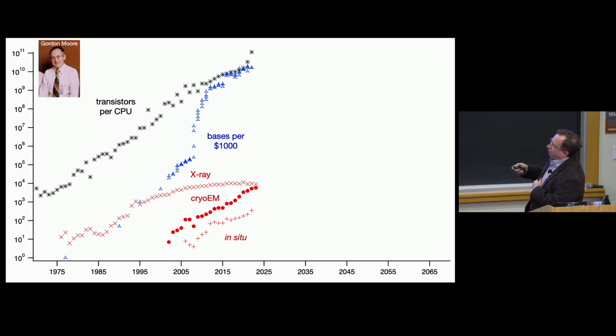If we now come closer to home in structural biology, if you look at the number of X-ray structures that have been solved, it was on an exponential trajectory for quite a long time, a couple of decades, but it did plateau, and now it is in decline, clearly. Whereas cryo-EM has now been on an exponential trajectory for some 10 years.